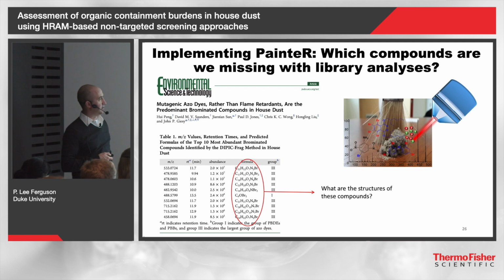They analyzed these using negative ion APCI. It so happened that we had almost identical samples that we'd analyzed in our lab 3 years ago. So we went in and retrospectively pulled out the data. These were run on a Fusion system at San Jose. We took some samples and did some tests before we ever bought our Lumos.